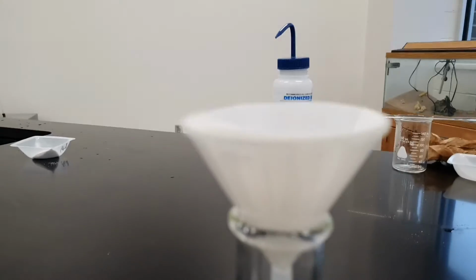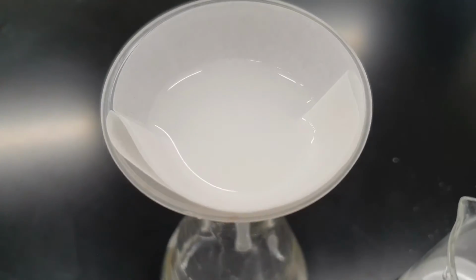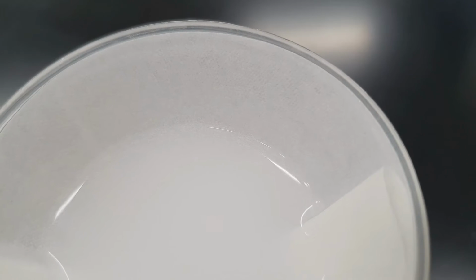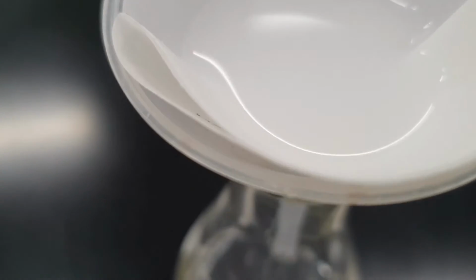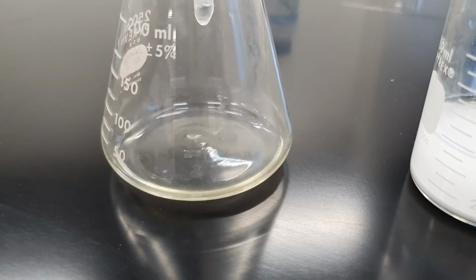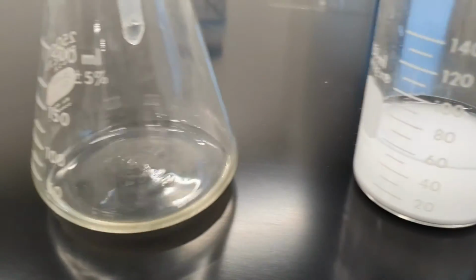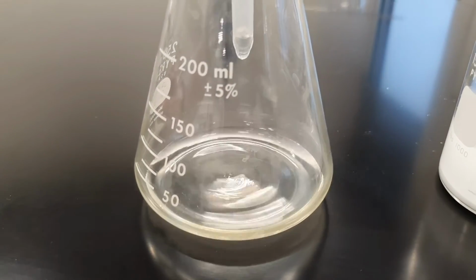So if we go up and look at what's happening on the Erlenmeyer flask up top here, it doesn't look like much, and you can't really see it, it's not picking it up, but you can start to see there's a little bit of white solid that's starting to filter out on the top of that filter paper. And that's why we're getting that clear solution on the bottom there. So if we compare the two again, cloudy has our precipitate in there, a solid that was formed from those two solutions. Clear, all that precipitate is being filtered out.